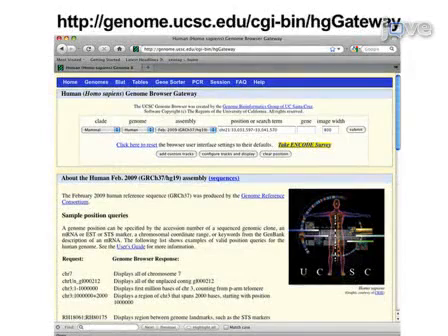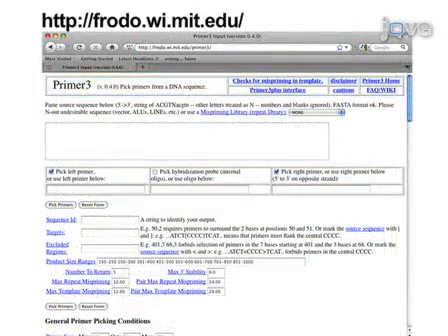We examine the entire interval to the adjacent genes and determine a locus-specific LOD score cutoff corresponding to approximately the top 5% of non-coding sequence. After selecting sequences, design primers using Primer3 to amplify each sequence from human genomic DNA. Primers should be selected to amplify the conserved region plus 30 or more base pairs on either side.